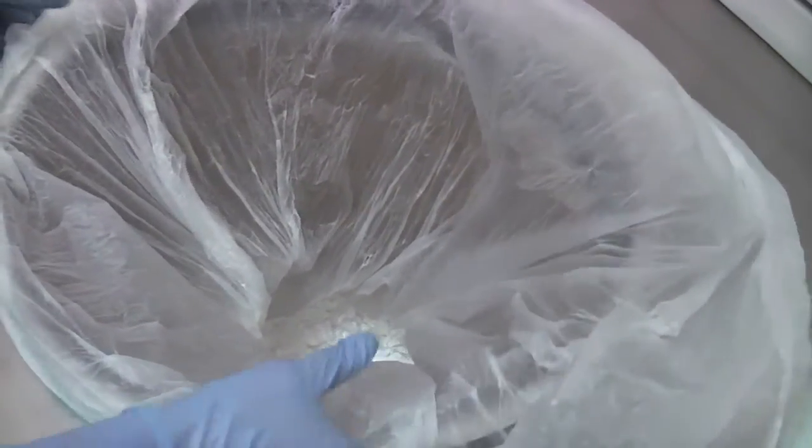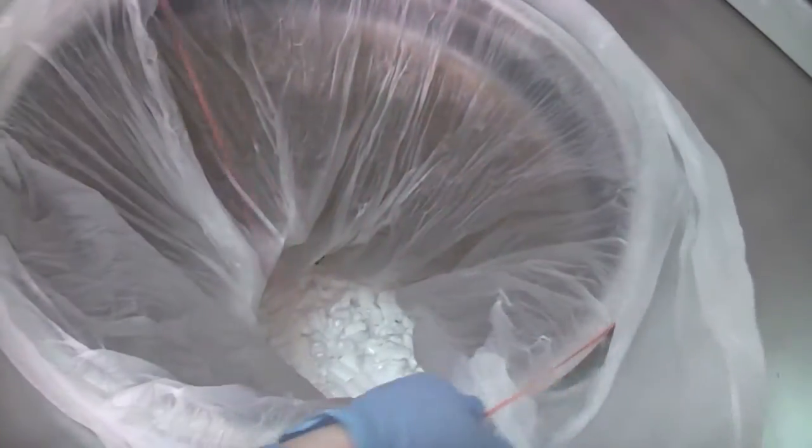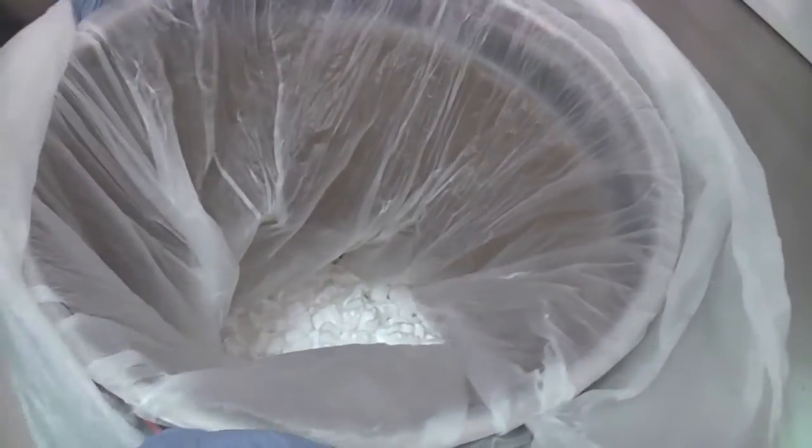Open the primary containment bag inside the source container and fasten it to the upper lip of the retaining ring using a retaining band. Now that the source container is loaded, wait 15 seconds to purge airborne contaminants from the work area.